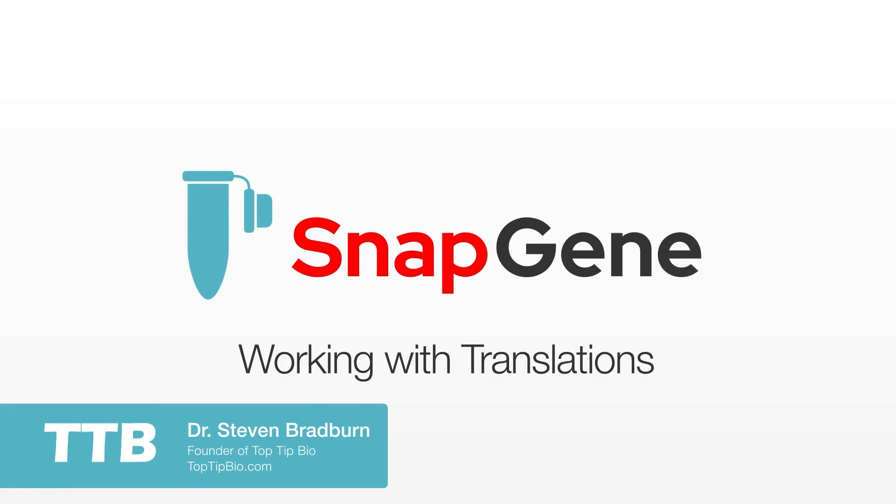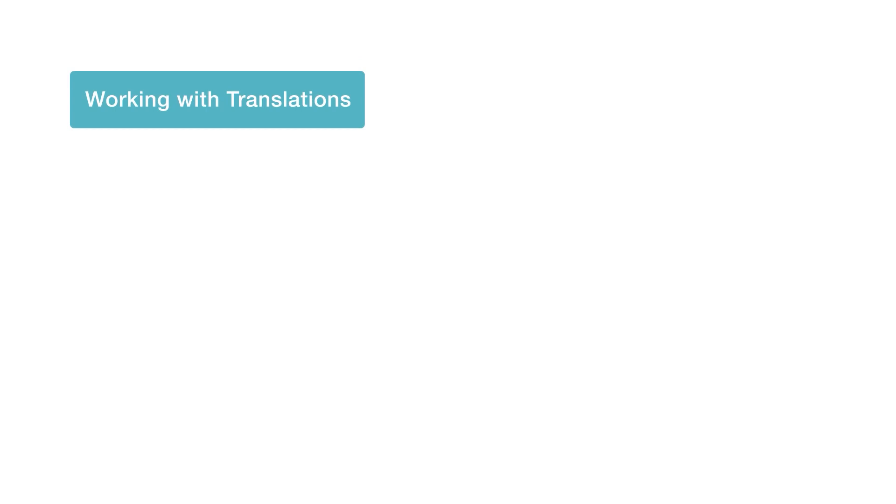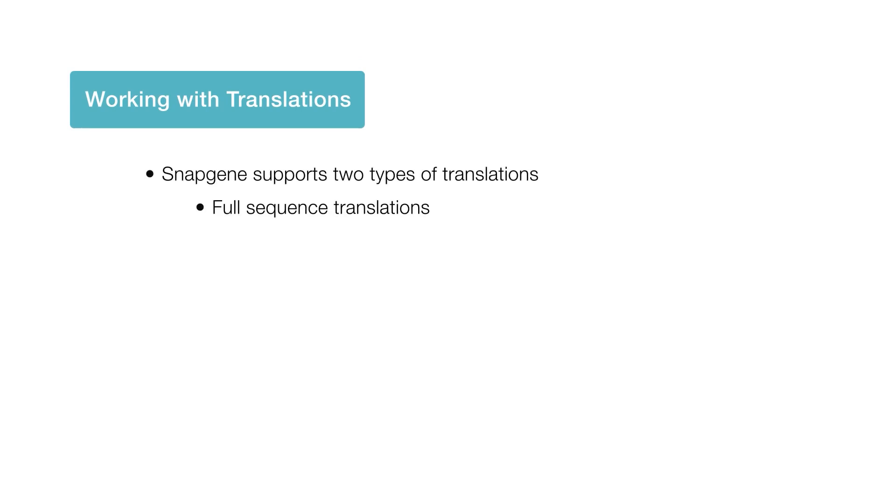In this tutorial I will show you how Snapgene can help you view and edit translated features, open reading frames, and whole sequence translations. Snapgene is capable of handling two types of translations: full sequence and feature translations.